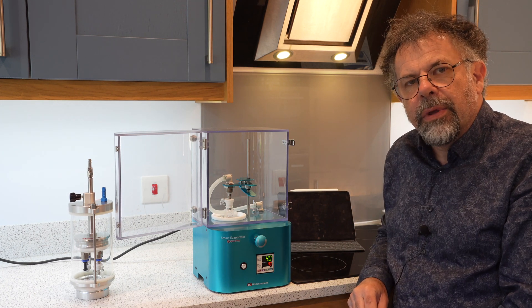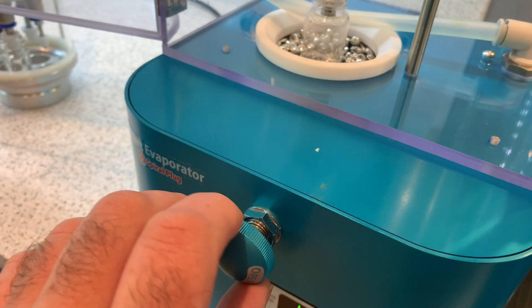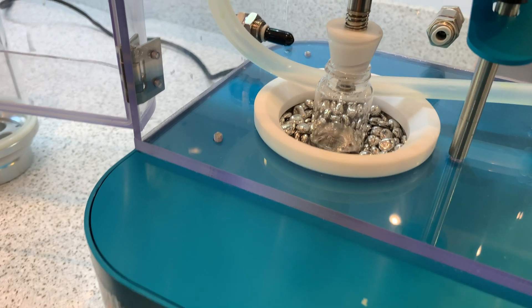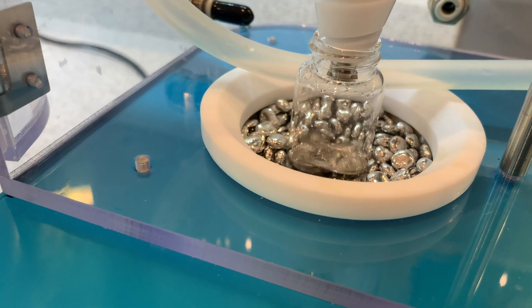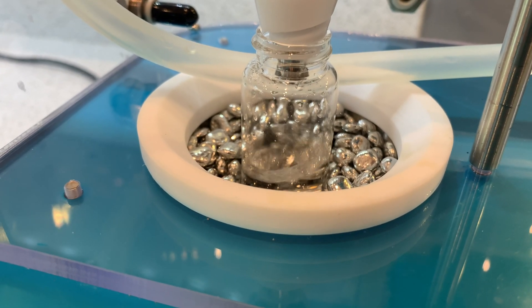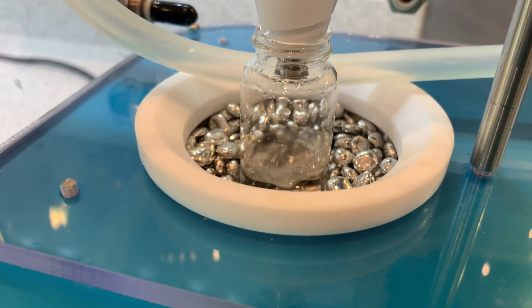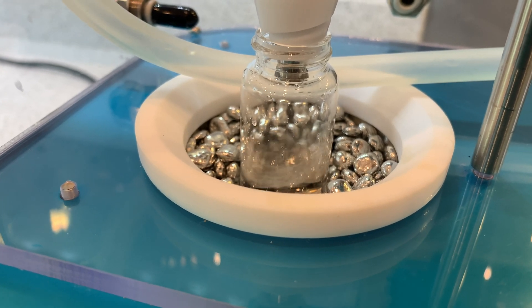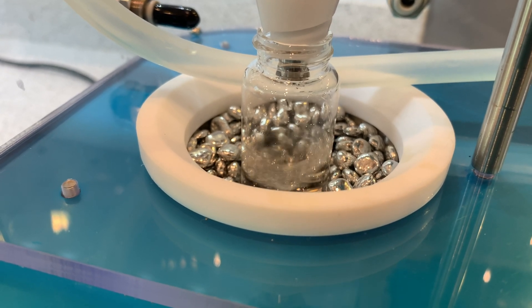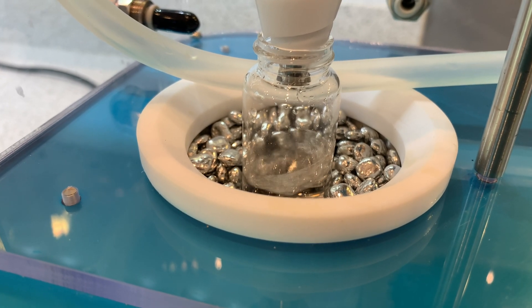Now I'm going to turn the vacuum on and show you a close-up of the plug in action. At the front we have a simple control valve which controls the vacuum flow through the tube. As we increase that, we start to get a vortex. It's important not to fill the tubes more than halfway, as this prevents any materials escaping into the vacuum line.